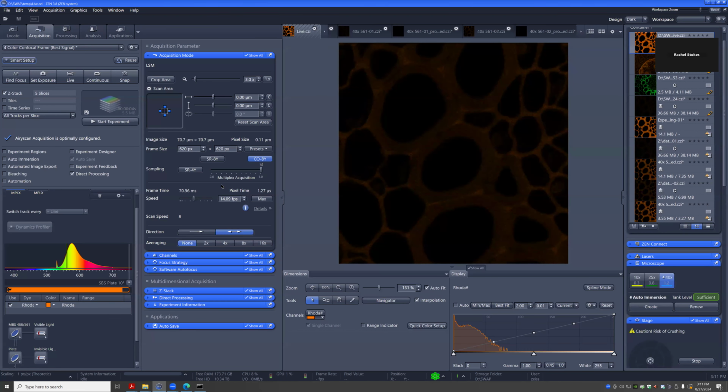Here you go from 2 to 1, right? And that's really the range. If I move this slider, you can actually sit in between a little bit. So now it's in between confocal and super resolution. You can play around with these numbers a bit, but generally you're going to do either this or that.